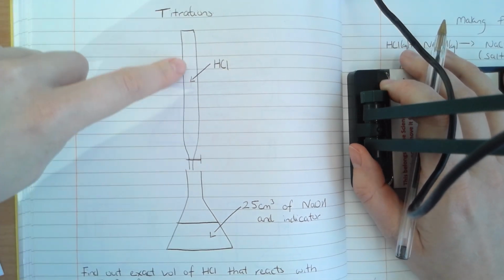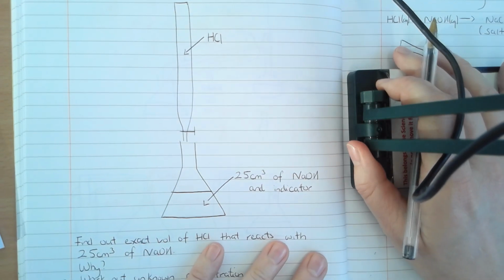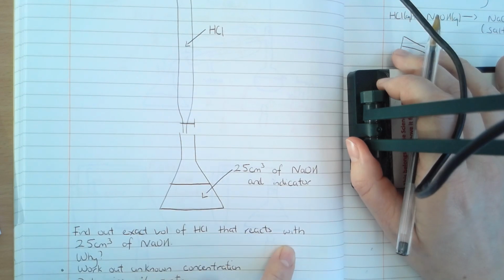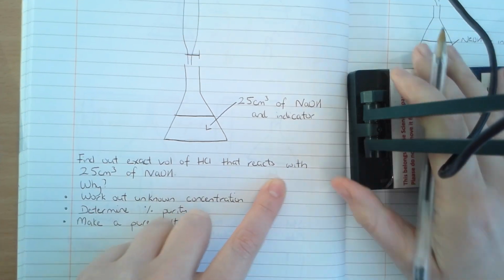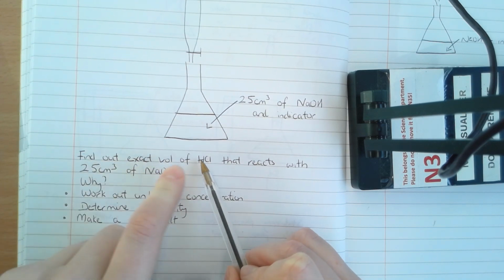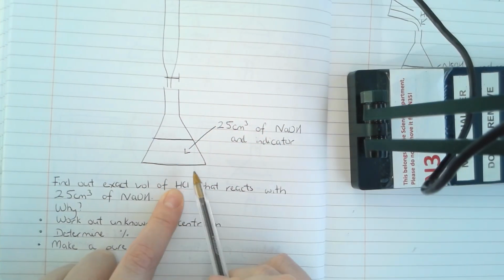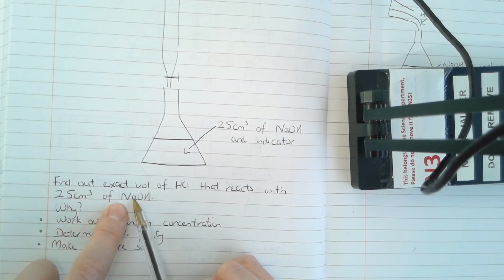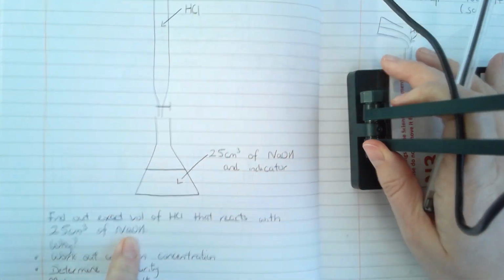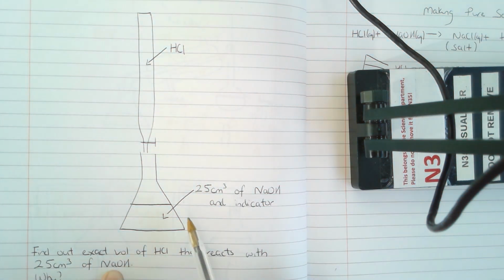You've got this long thin piece of glassware called a burette, and then underneath you would place your conical flask with some form of indicator. If we look at why we're actually doing a titration, the whole point of it is to find out the exact volume of one solution. So I've said HCl, that's in my burette, that reacts with a known volume of another solution. So I've said 25 centimeters cubed of NaOH. That's the point. At the end of a titration, I will know exactly what volume of HCl I need to react with 25 centimeters cubed of NaOH.